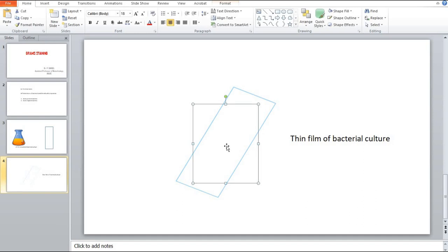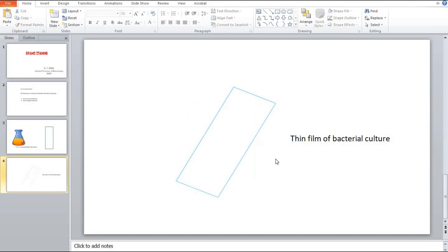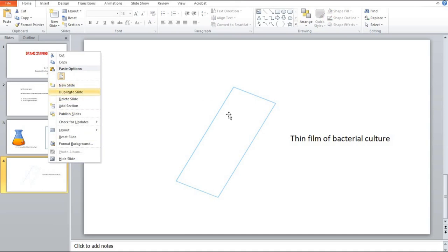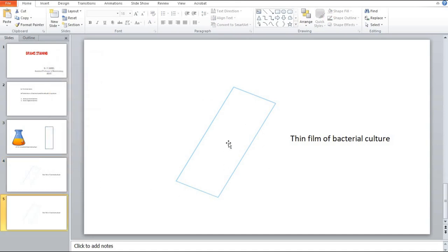After preparing the smear, you cannot see anything because bacterial culture is transparent. No bacteria is colorful — it is colorless. You are making the smear over a colorless background, so you are unable to distinguish the area on which the culture has been spread.